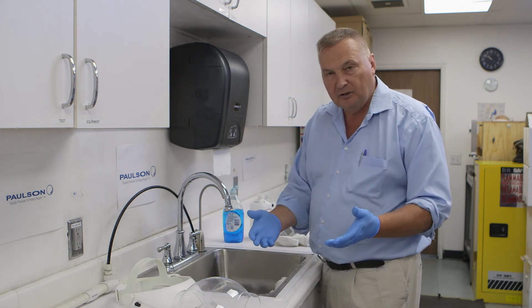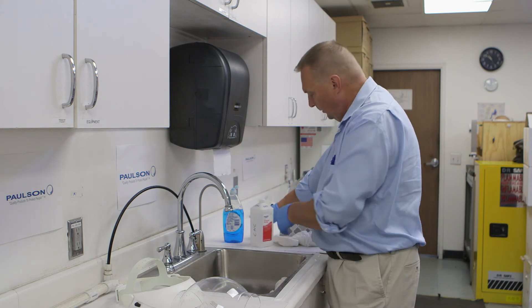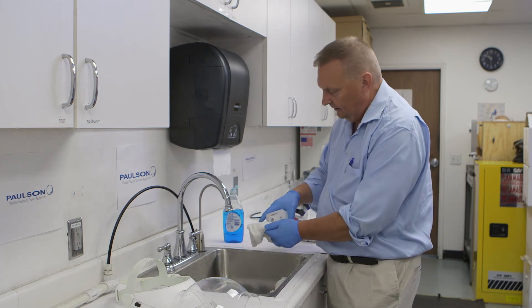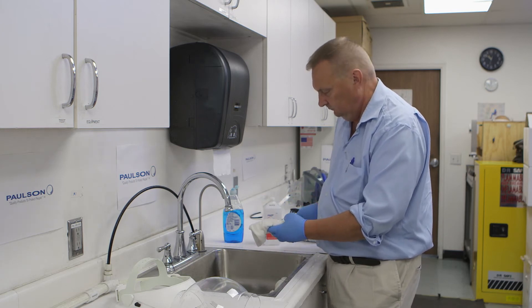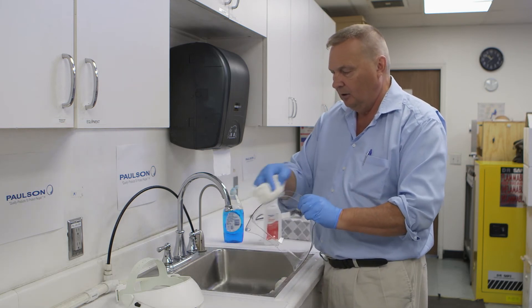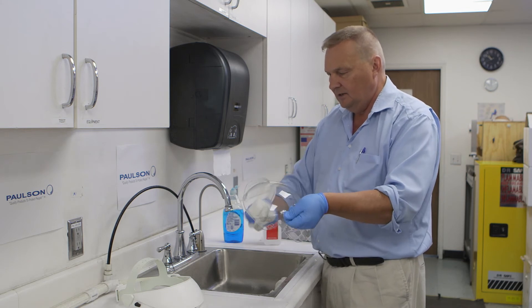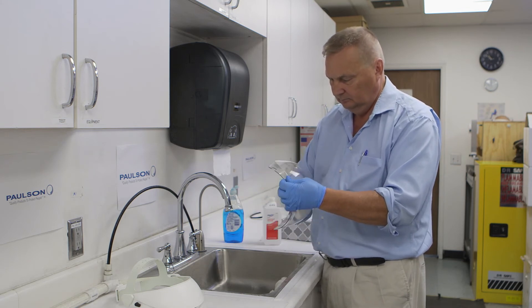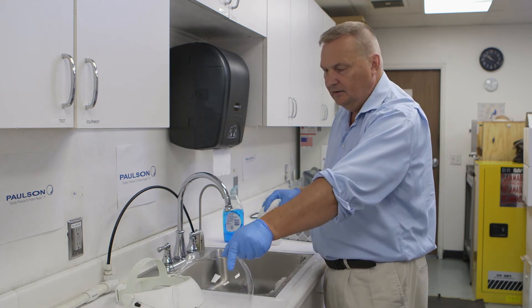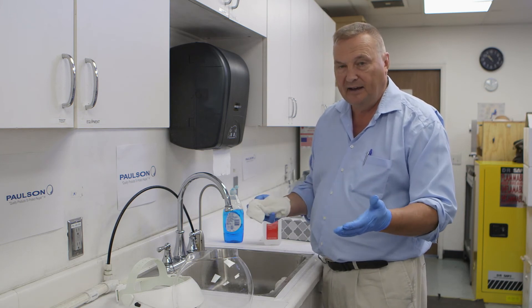Now we move to the sanitizing step. We're going to take the 91% isopropyl alcohol and put that onto our damp rag. Then we wipe the isopropyl alcohol onto the product, including all of the edges, inside and out. Set it to the side — we're not going to dry it; we're going to let the isopropyl alcohol naturally evaporate.